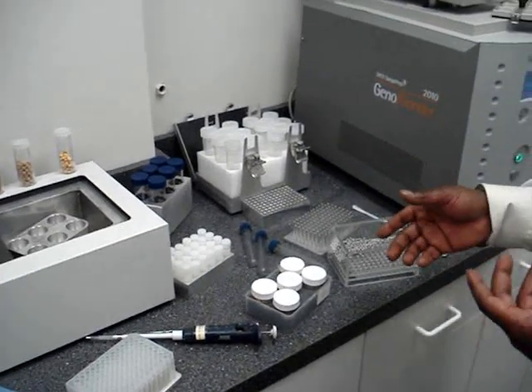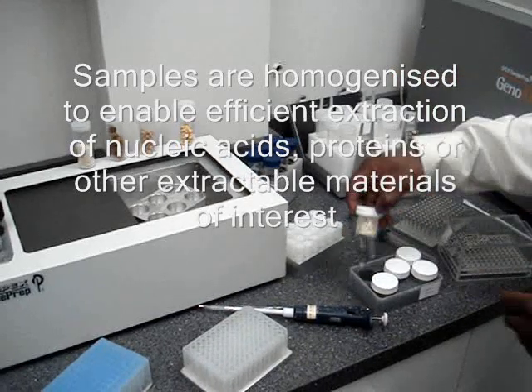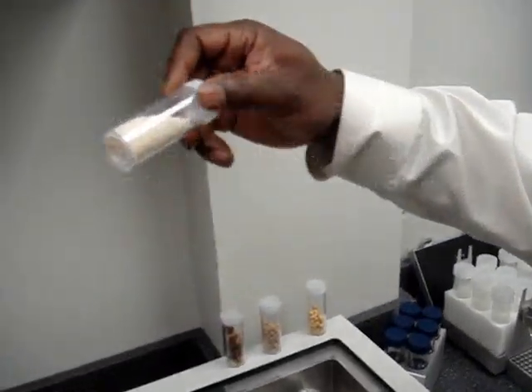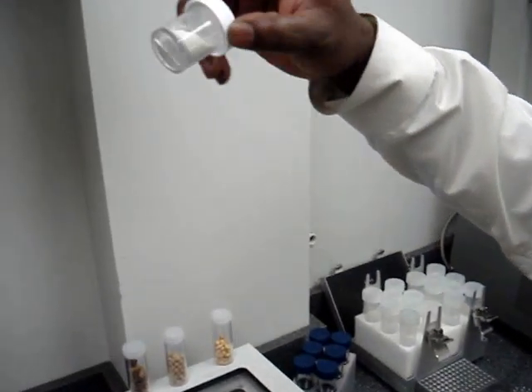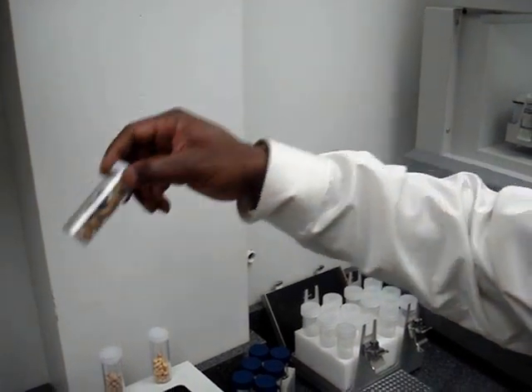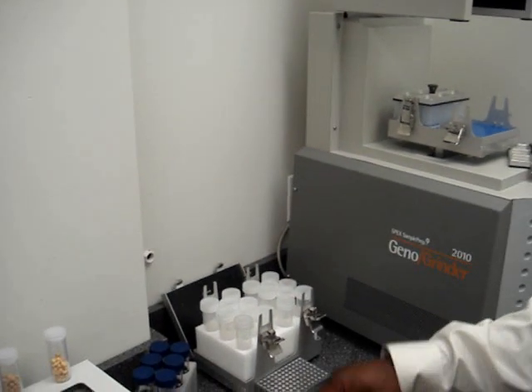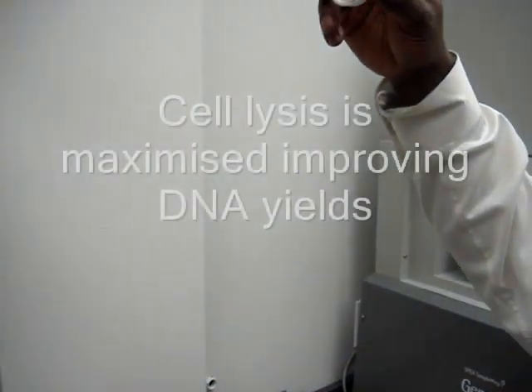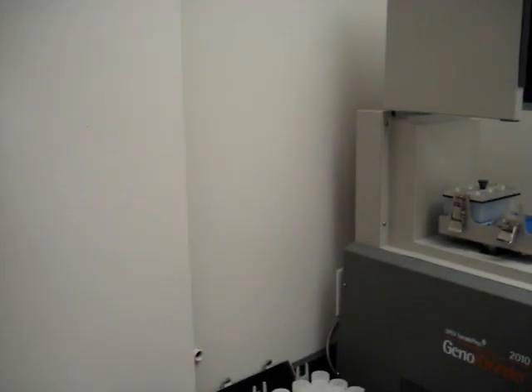Next I'd like to show you some of the samples that were accomplished by using the Geno Grinder. First we have rice — this is before, and this is after: a nice fine powder. We also have dog food, which has been particularly interesting in the research community for the melamine studies. This is the dog food afterwards. Soybean — a lot of companies use soybean for a lot of their research. And lastly, corn.